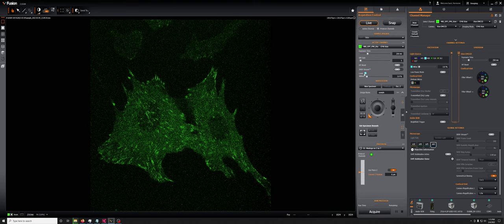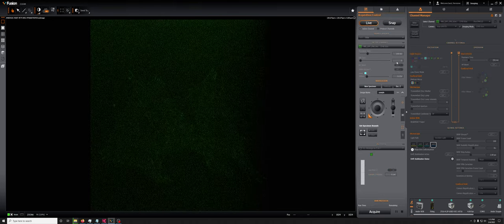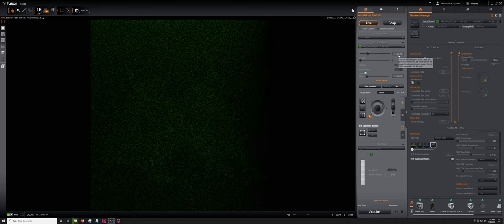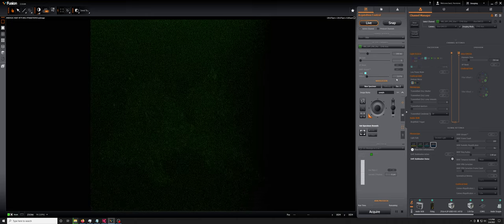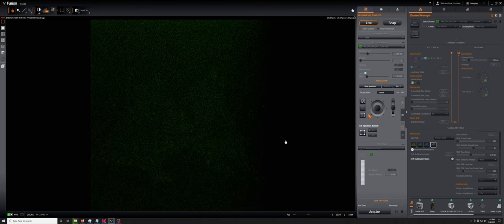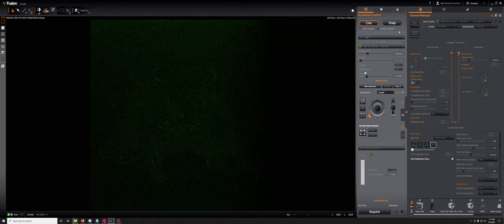So if we go to live, we currently have the EM gain set to five, and the exposure to 250, the laser at two. You can see, well actually you can see that we can't see anything.